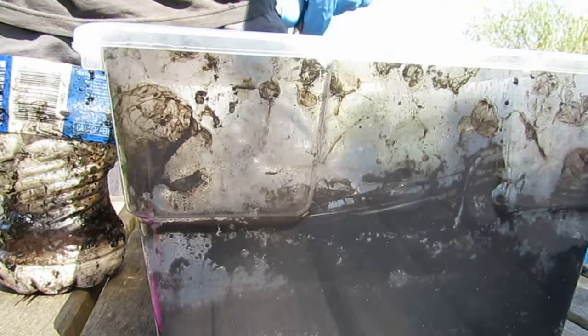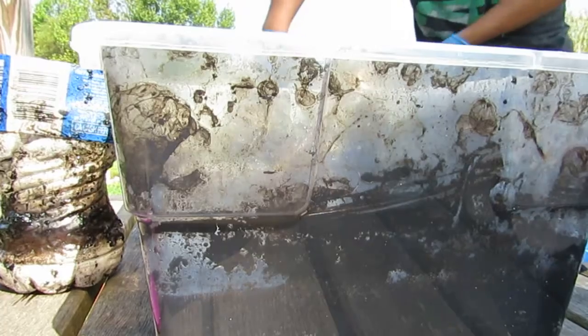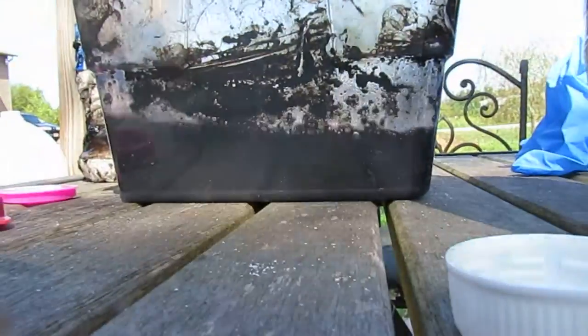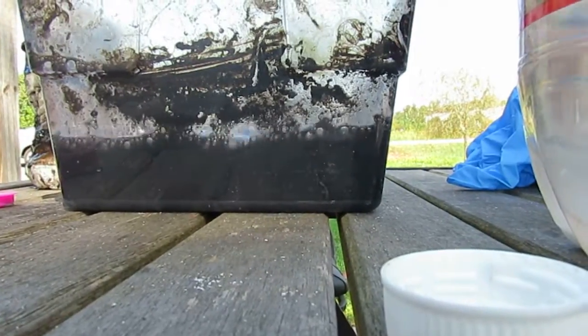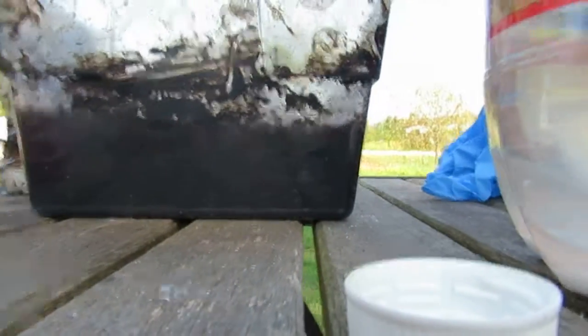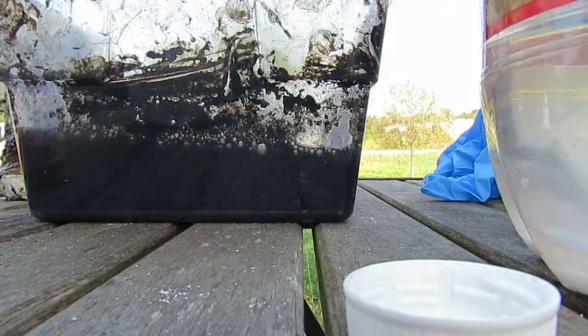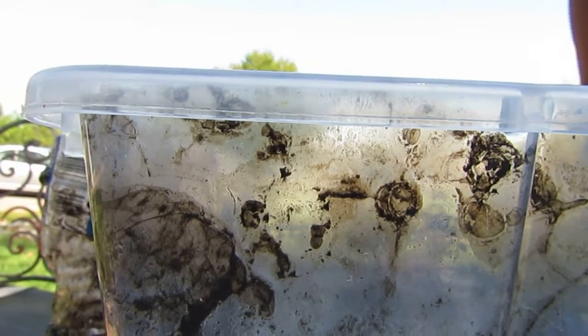It's still bubbling a little bit — it's just dispersed. Oh, my stick fell in the water. Oh, that's sulfuric acid. Okay — this was my mixing stick. Whatever.